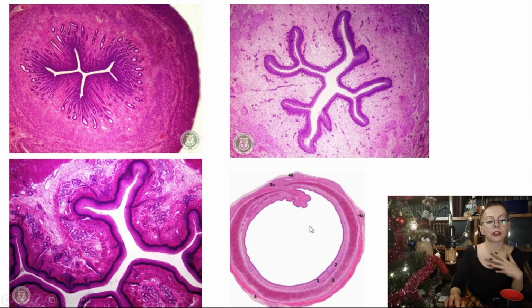First of all, the shape of the lumen in trachea is always rounded and smooth, while in all the other organs they are collapsed, so folds are formed. Trachea also has a special seam-like appearance because smooth muscle cells on the posterior wall contract after death, and that's why C-shaped cartilage turns into sigma-shaped. So trachea can be distinguished easily.